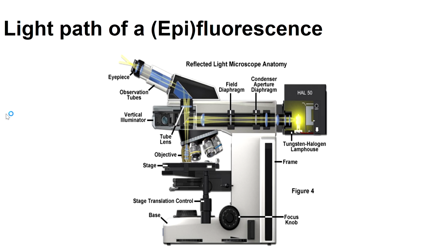The microscope that we're going to have in our lab is a fluorescent microscope. It is pretty fancy, but it's built on top of a light microscope. Pretty much all fluorescent microscopes are built on top of a light microscope. So if this is a light microscope, you have light coming this way, hitting your sample, going through the objective lens, and getting reflected to your eyepieces, right?